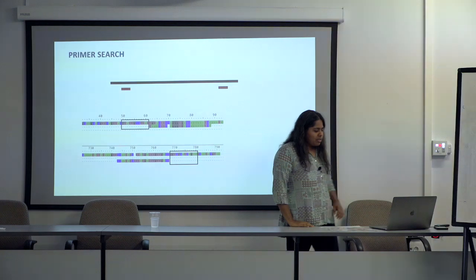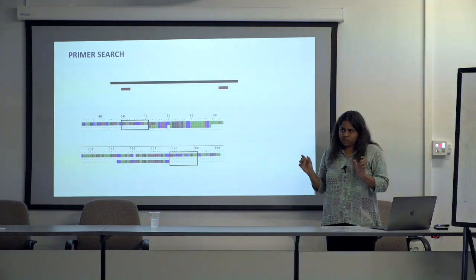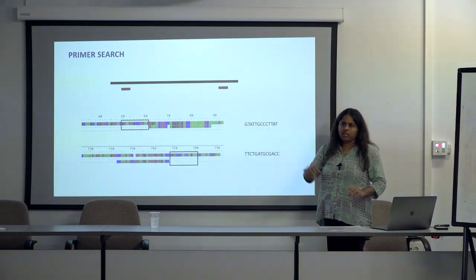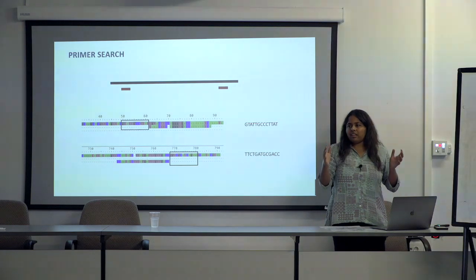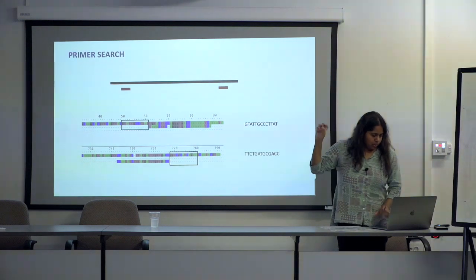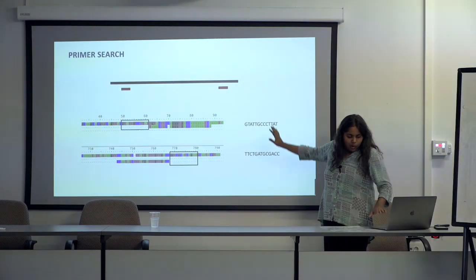This is mostly done because we are not aligning each tag individually, largely because of the nature of our barcodes, which are very short. So we want to be extremely precise. And once we fish that out, we match it to your index information. The index information is also stored along with its errors, so the mutant tags basically, and then matched to those mutated tags. And so yeah, that's basically the process of demultiplexing.